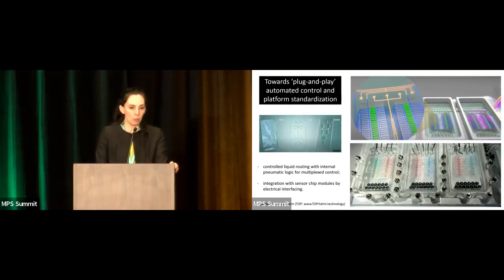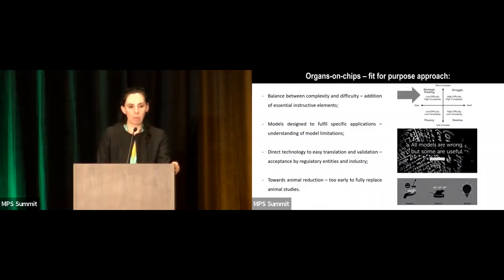Basically, what we want to do is create complexity, but in an easy way, so that we can also enable standardization and automated control. So the idea here is to create a plug and play system where we can connect these chips in an easy way. So just enable the connection of different designs and also enable different readouts in an easier and more facile way that we can all understand and work with.